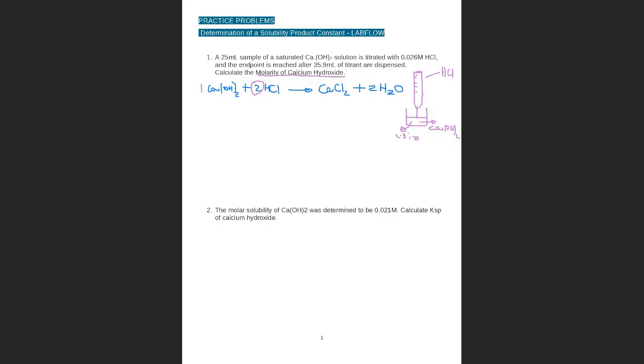Why do we need the indicator? The indicator will change color at the end point. What is the end point?